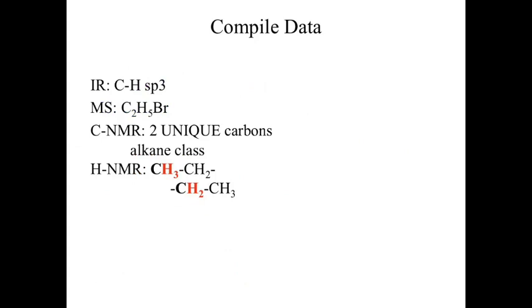According to our hydrogen NMR, how many carbons do we have? Let's see, 1, 2, 3, 4. That's kind of problematic considering that my Mass Spec says I only have 2. If we see this layer of duplication, we can go back to our hydrogen NMR and ask, did I duplicate something somehow? Is this CH3 the same as this CH3? If there's nothing chemically distinct about those 2 pieces, then in the process of analyzing that, I duplicated it. One of those can disappear.